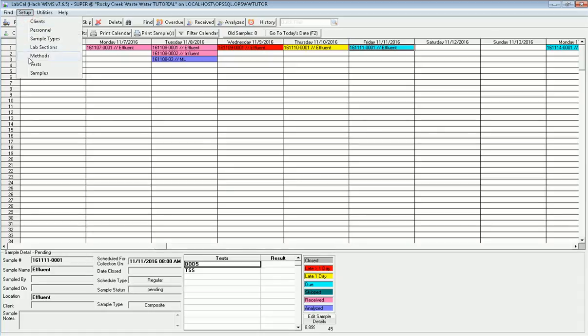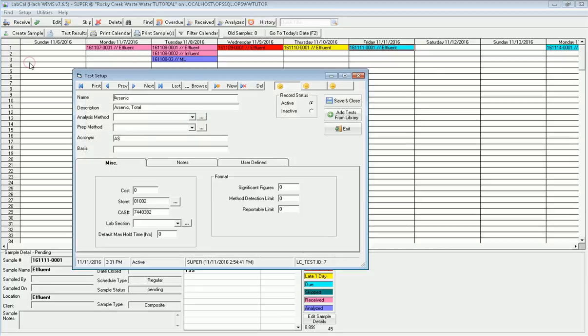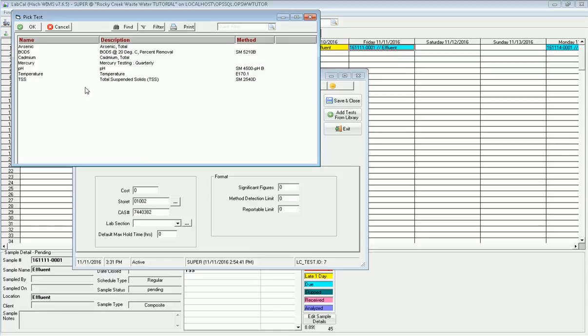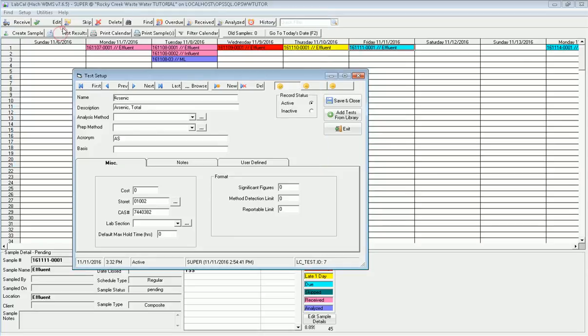Now I'm ready to make sure that I have the test that I'm going to run with this particular sample. I go into tests and I'm going to run metals, which is arsenic, cadmium, chromium, copper, all that series of tests that we have. I'm going to click browse and verify which ones I have. I do have arsenic and cadmium, I have mercury, but I also need chromium, copper, lead, silver, and zinc. I'm going to go see if those things are available in the library.